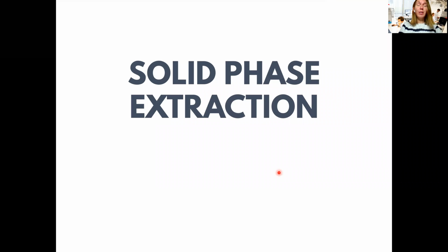In this video, we are going to look into solid phase extraction. One of the last things we talked about in the last video on liquid-liquid extraction was that, in spite of being very efficient, liquid-liquid extraction has the drawback that very large solvent quantities are often used, which is not very environmentally friendly. Additionally, it's often not very automatable.